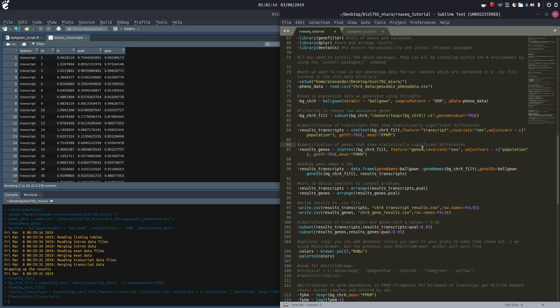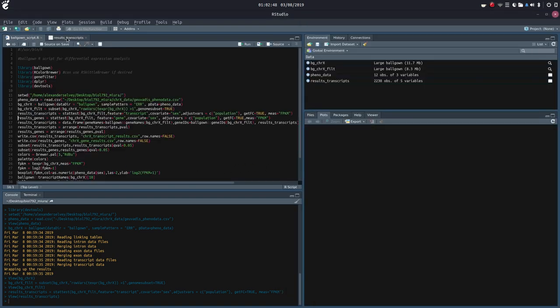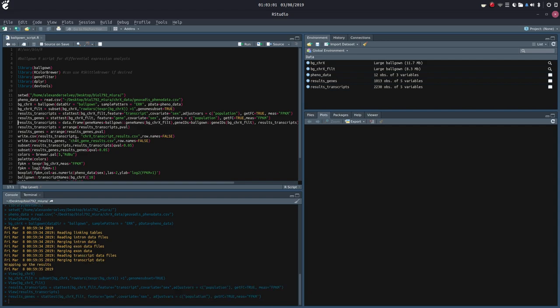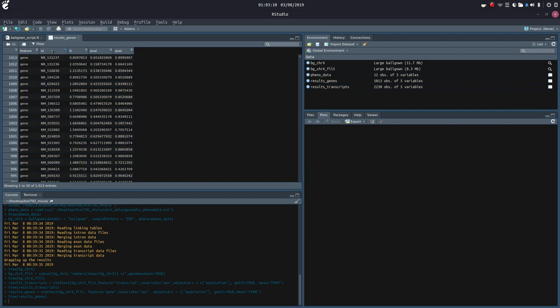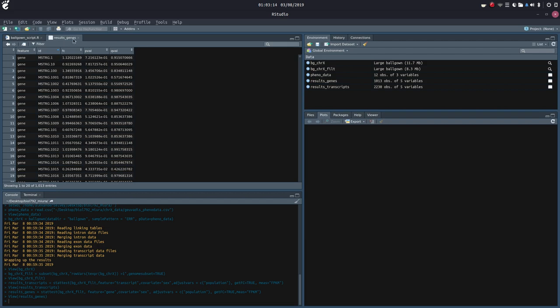Identification of genes that show statistically significant differences. So we did transcripts — now we're going to do genes. Again, we're going to use stat_test with our ballgown filtered environment variable, with the feature gene, covariate sex, adjust vars for population variances, and we're going to get our FCs and our means in FPKM. We're going to save that in a data frame called results_genes and populate it over here. Now we can see that our results_genes is leveled by the ID. We can go up and down and check out the different labelings of IDs.